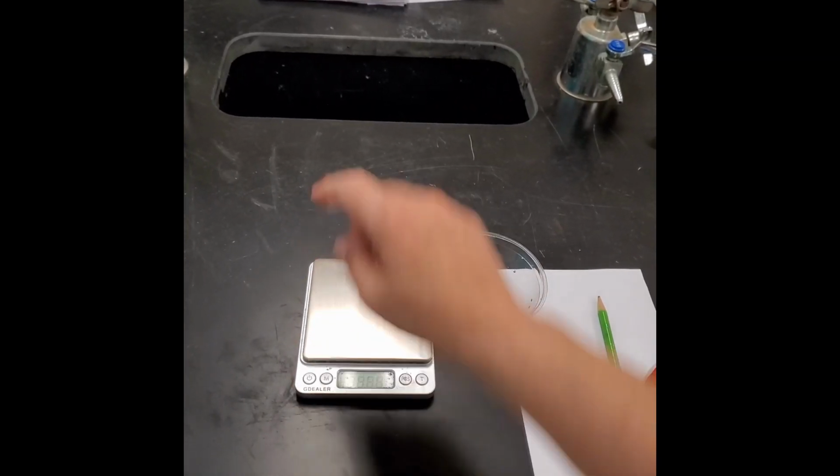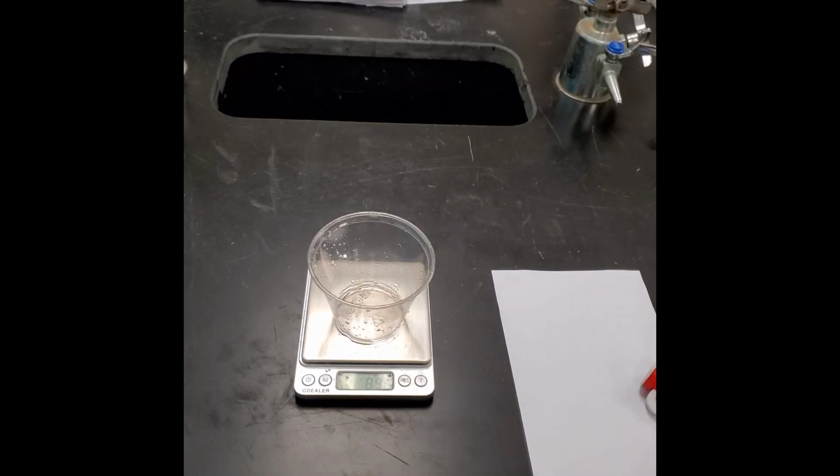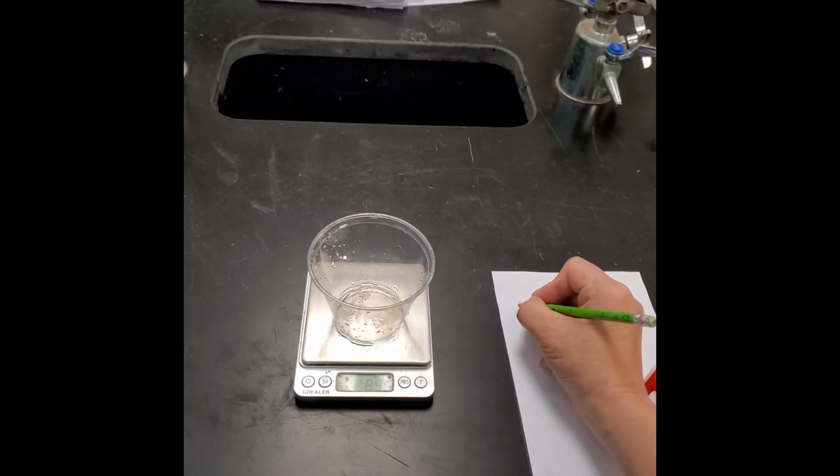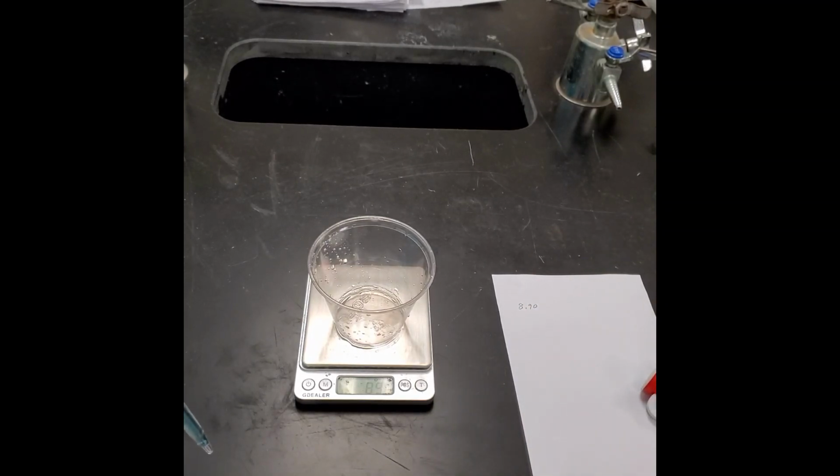So what you're going to do is turn your balance on, put the cup on, and read the mass of the cup. So I have 8.90. Do not hit the 0 button. Just leave it as is because we'll subtract this out.